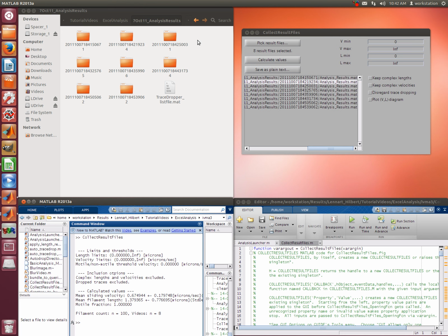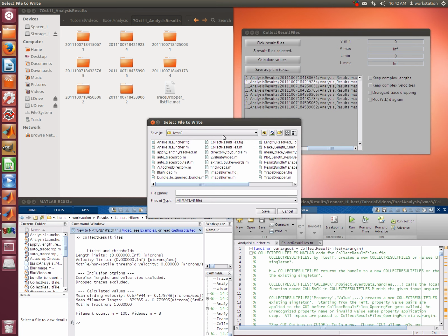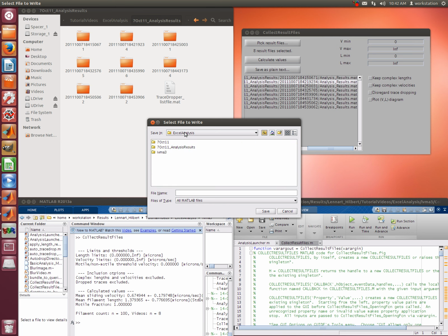And let's get back to a couple more options we can actually find in here. There's the option of saving as plain text, which can be helpful if you do want to go back to working in spreadsheets, but you don't want to work in separate ones. So let's try this one out. Yeah, I guess we can add it into here. Combine spreadsheet.